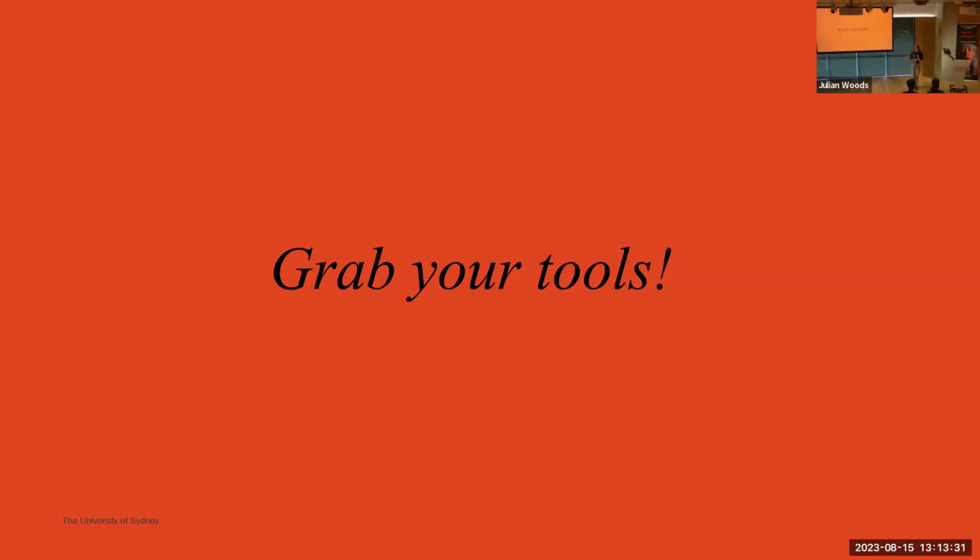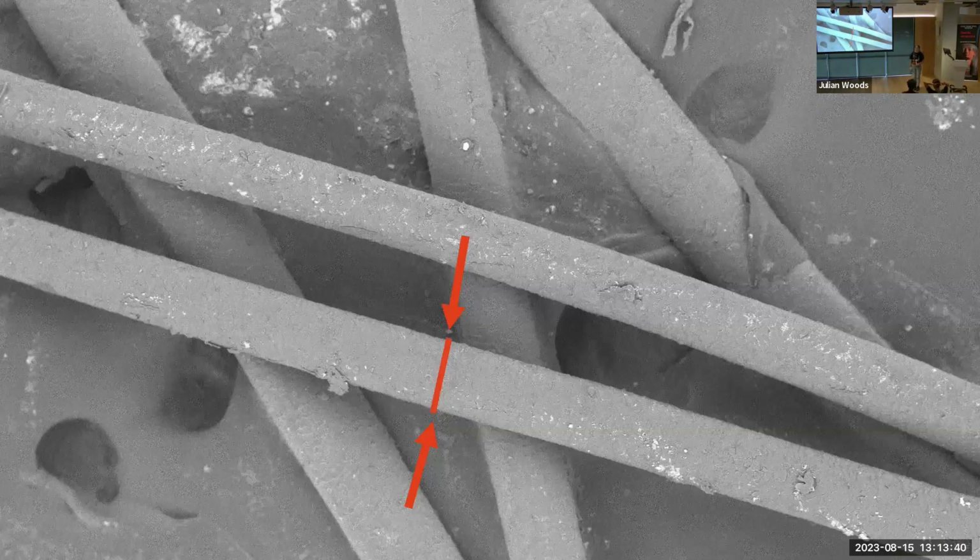What do you notice on it? Not much. It's very small, right? And we can't see much detail. But as we go into the images that are formed by electron microscopes, we see different things on the hair. And this is actually my hair. I've sacrificed myself for science.